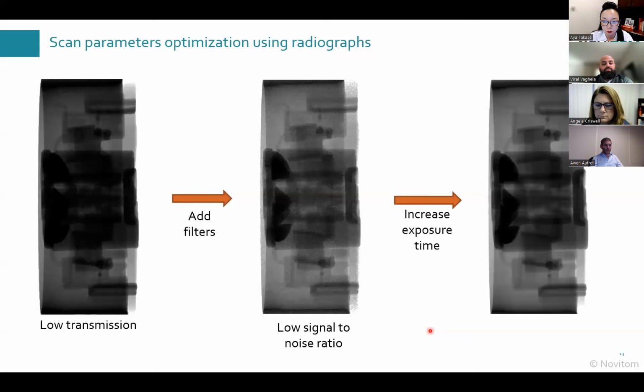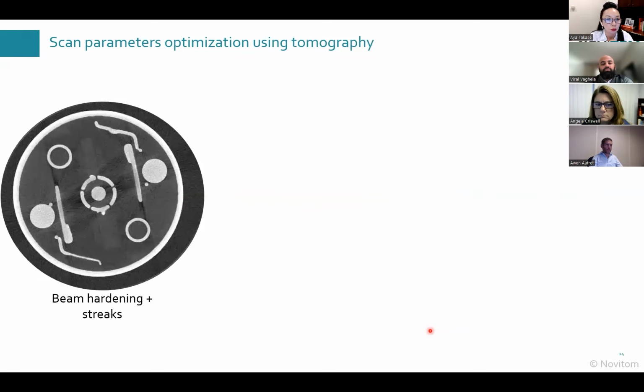So this is really simplified because you have a lot of parameters that you can tweak also, but this is a possible way to optimize just these two parameters. And then you can go to the tomography slices, and if you have to do an analysis on the tomography reconstruction, you can run the full simulation, reconstruct the volume, and try to do your analysis.